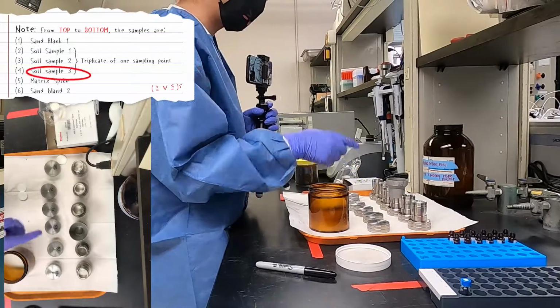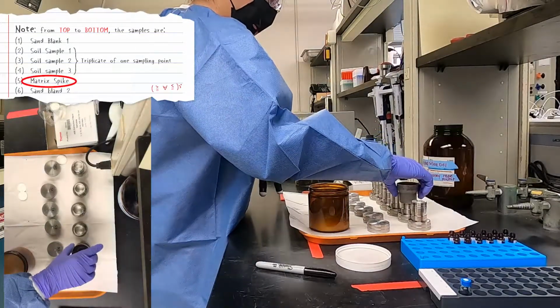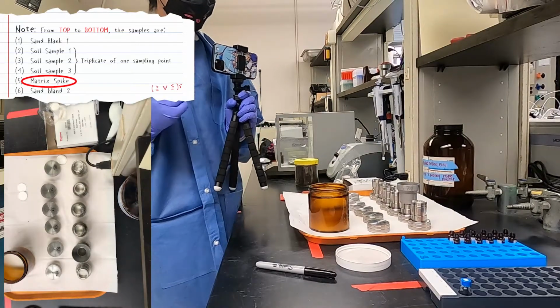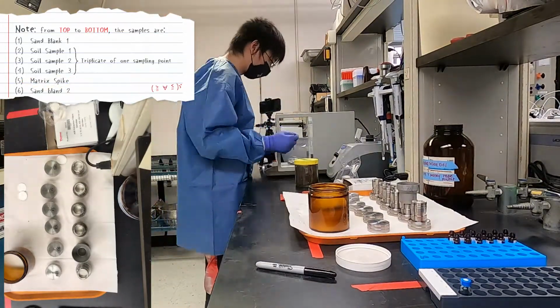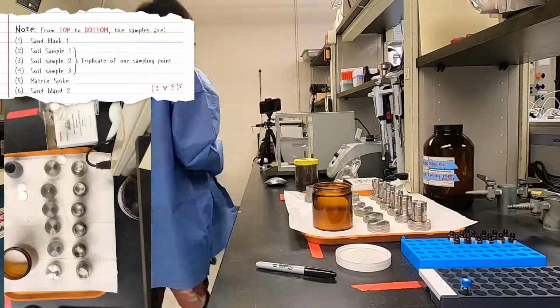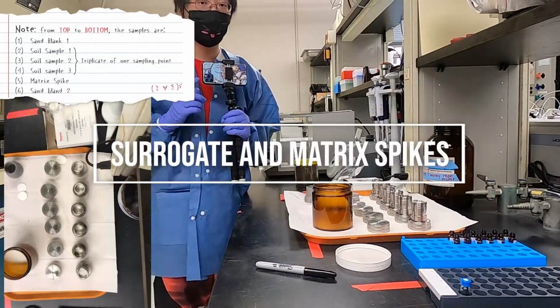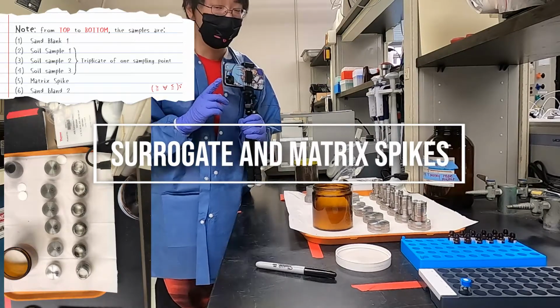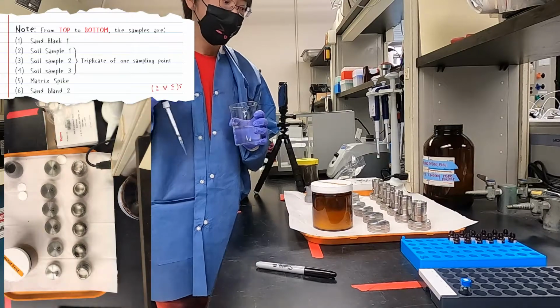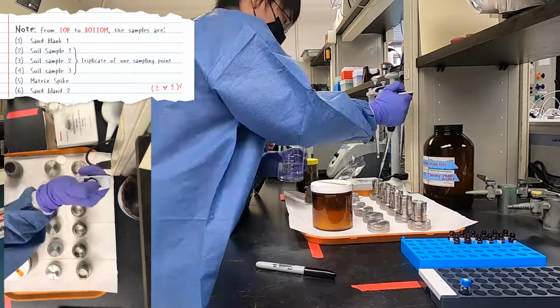And the next one is the matrix spike. For the matrix spike, we are going to use the clean soil instead of the sample soil. And then the next step is to add surrogates and spikes. So first, let's add surrogates. We are going to add the surrogate to each of the columns.